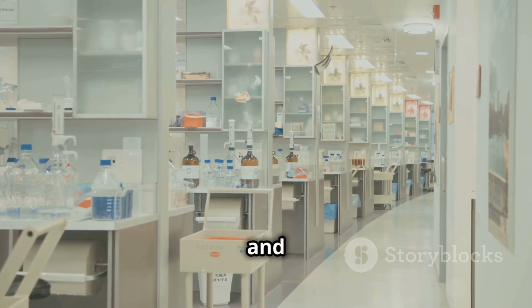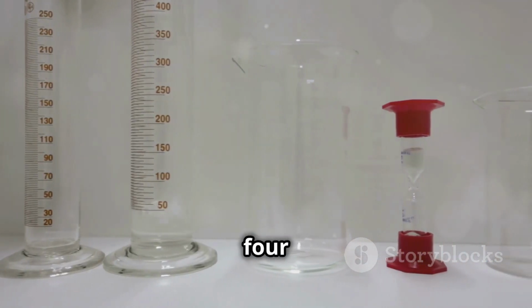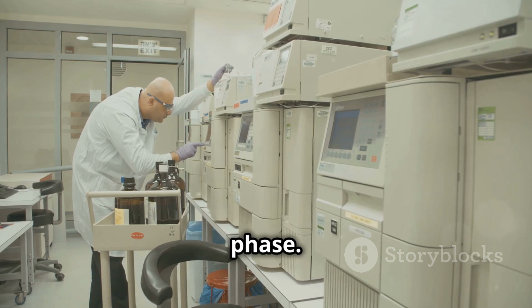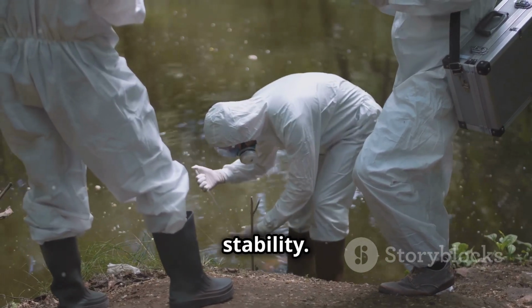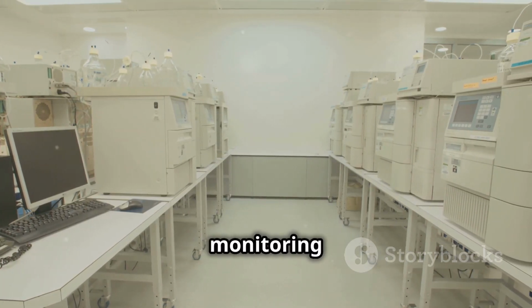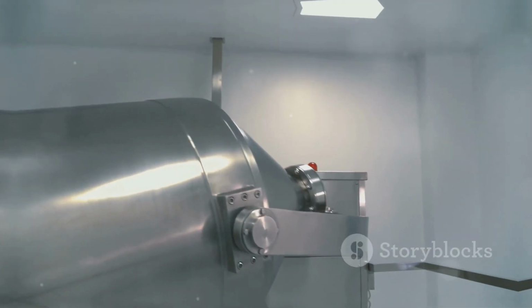Validation strategy and phases. Phase 1 is the initial testing phase. Here, daily testing is conducted for 2 to 4 weeks to stabilize system performance. Phase 2 is the monitoring phase. During this phase, bi-weekly testing is performed for another 2 to 4 weeks to verify stability. Finally, we have Phase 3, the long-term monitoring phase. In this phase, monthly testing is carried out for 1 year to confirm consistent performance.